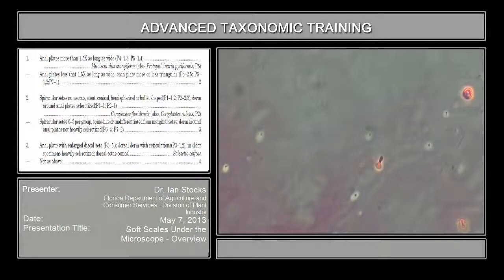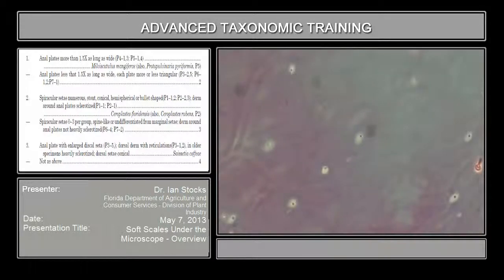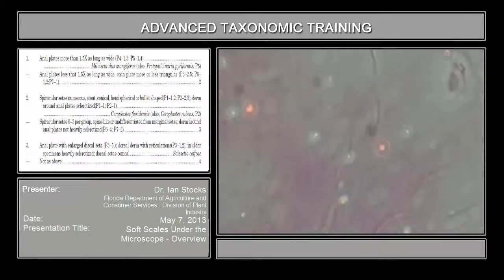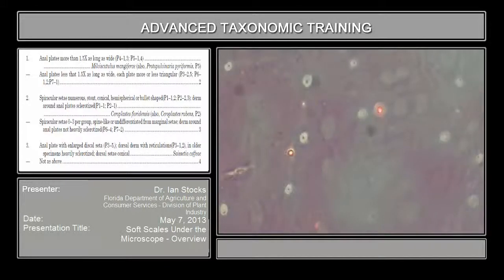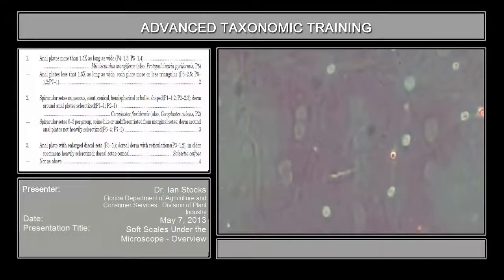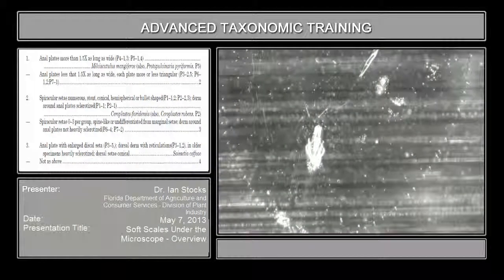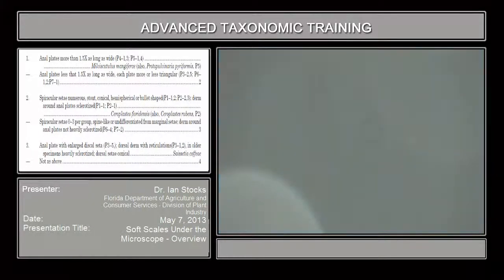That's characteristic for this genus, but those dorsal setae can vary to being very conical and stout, fairly short, pin-like. Again, just a tremendous amount of diversity, but fairly consistent at the level of individual species. And there's various other ornamentation types too, like pigment color patterns. So you can see there are various clear spots here, changes in staining intensity, reflecting differences in levels of sclerotization, but those are generally not a character that we would be interested in, except for a few cases where they're so distinct that they actually are part of the diagnosis.